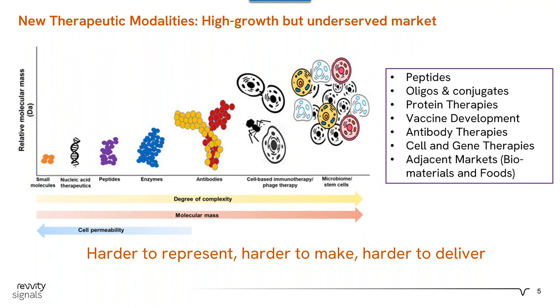So I think it's a good starting point just to level set ourselves. Obviously today we'll be talking about T cells some more on the right-hand side, but I wanted to mention that before we jump into our experimental workflow.